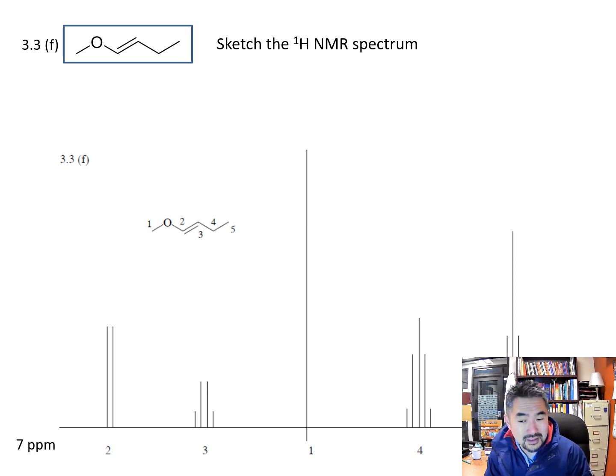And so here's this sketch, right? The tall singlet and the slightly shorter triplet are both worth 3 hydrogens. And signal number 4 is also worth quite a bit because it's worth 2 hydrogens. The quintet, like we talked about. And these two methines are smaller peaks with less integration because they're both only worth 1 hydrogen each. One of them was more upfield right here because of the resonance, and one is more downfield. Okay, so that's the sketch.